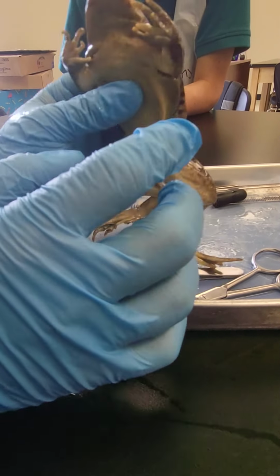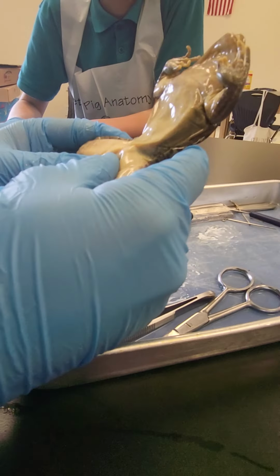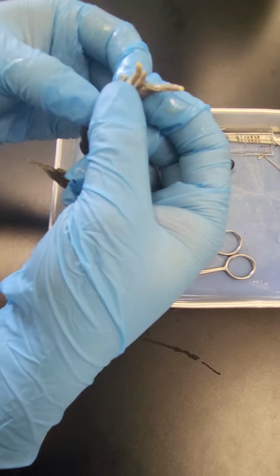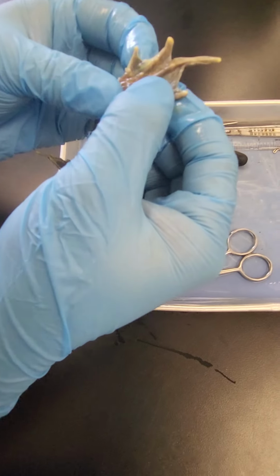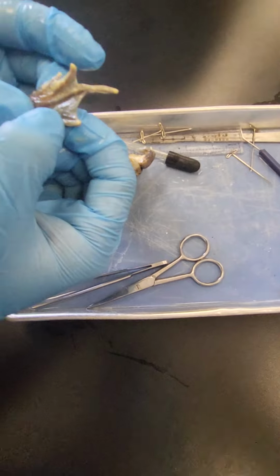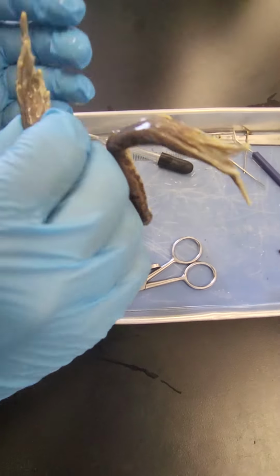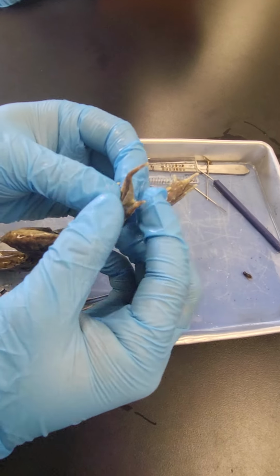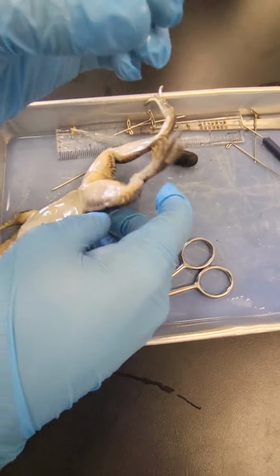What's the first step? We have to examine the hind legs. How many toes are present in each foot? Okay, let's see. Five? One extremely long one. Two, three, five. There's five. He has a middle finger before his toes. Okay, he has five on the other one, too. No way. He has five.